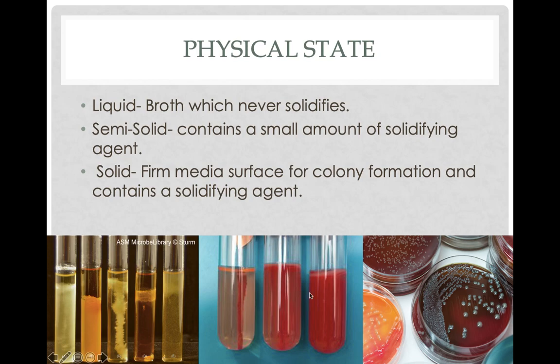Whereas over here, you'll see a semi-solid media, which is kind of like Jello. It's sort of solidy, sort of liquidy. These can allow bacteria to move around. You can see here these guys can't move. They're exactly where you stuck them in a little streak. These guys could swim around and swim through the agar. This allows you to see if bacteria can move or not, which is a big important thing. If you get an infection, are the bacteria stuck where they're at, or do they have the ability to swim from, say, your eyeball to your brain and cause problems that way? You kind of need to know that information. So this type of agar allows you to see that.